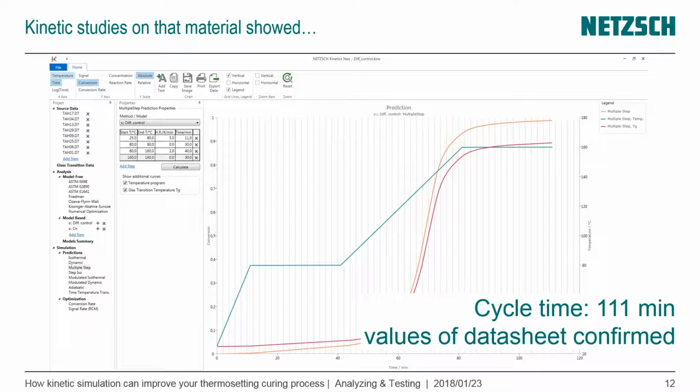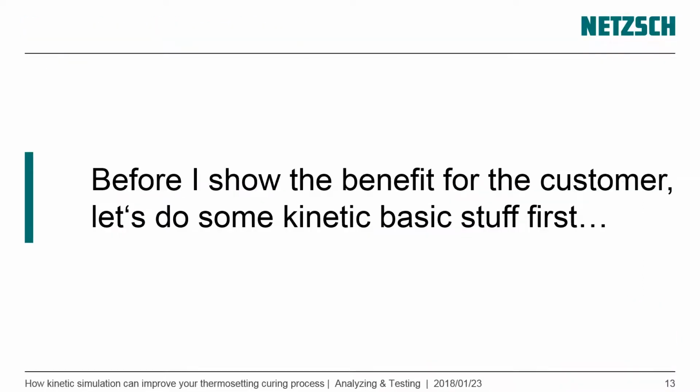And the orange line gives you the conversion. The conversion is very close to 100%, so to 1. And the customer told me the datasheet says we will result in a degree of cure of more than 95%. So it's all right.